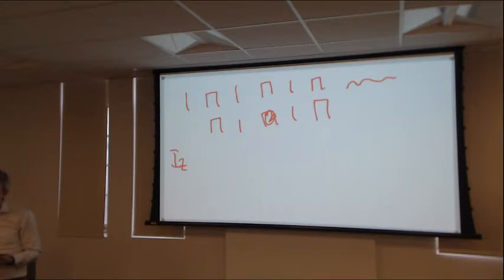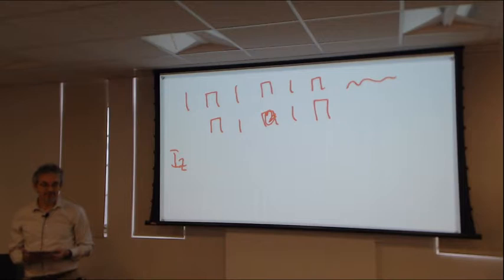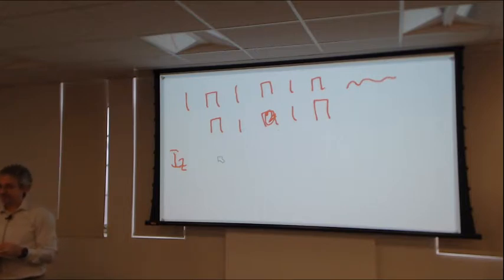If I need to add relaxation in, I'll usually just add some phenomenological damping by R2 whenever I have transverse magnetization for some time period. And then, just pick some reasonable values for R2 from my experience if I want to know how much signal I lose. So I can do quite a bit with what we already know. Now, I may want to learn some tricks so that I can reduce the workload that I have in analyzing these 10 pulses. But I at least have the tools.